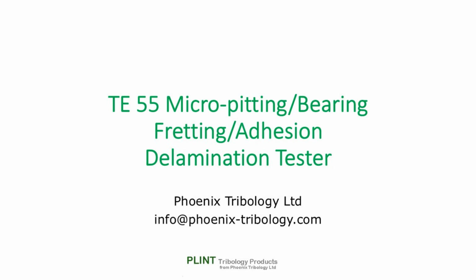Micropitting typically occurs in gears at a contact pressure of between 0.5 and 1.5 GPa and at slide roll ratios from approximately 0, the gear pitch point, and up to approximately 10%.